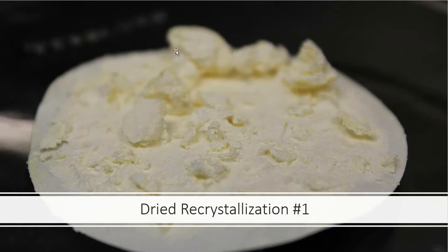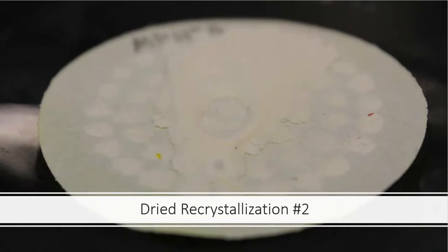So this is what the dried, recrystallized product looks like from the nitration of acetanilide. Whoo, that sounded fancy, didn't it? But guess what? That's where we are. This is organic. We're learning this stuff. All right, so this is the dried, recrystallized product from the nitration reaction of the methyl p-hydroxybenzoic acid.